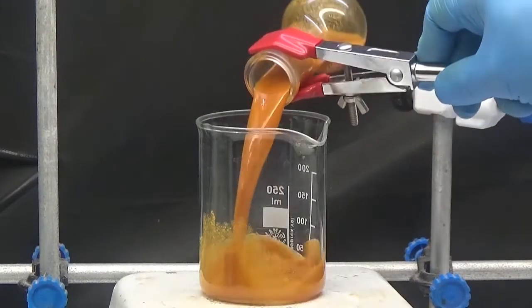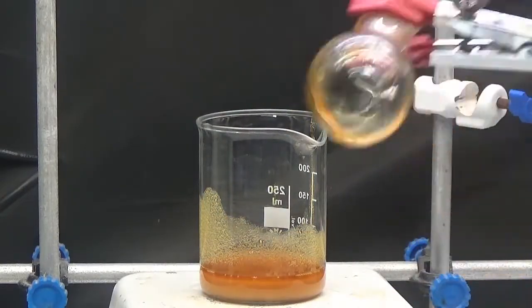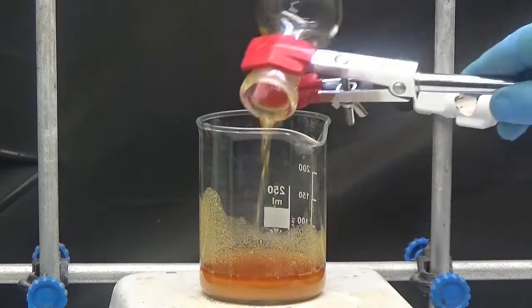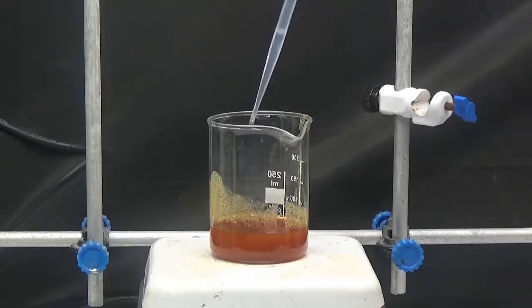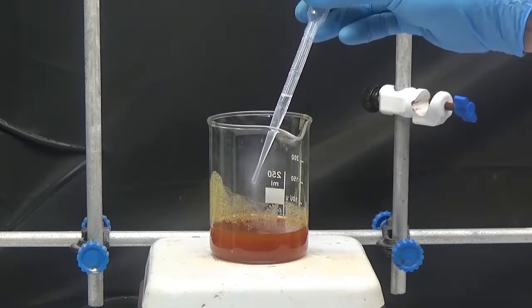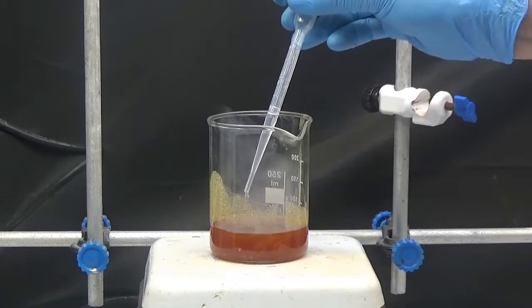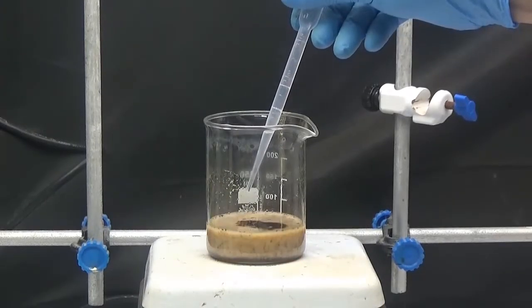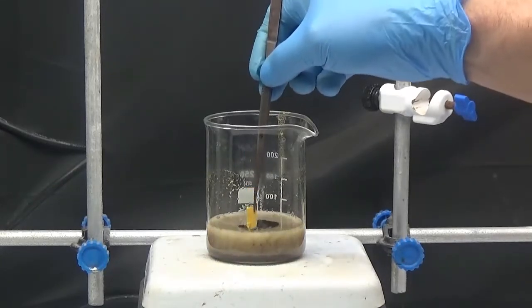Transfer into a 250 milliliter beaker and wash the flask three times with five milliliters of water. Slowly add concentrated hydrochloric acid to pH 2. A white precipitate with black residue emerges.